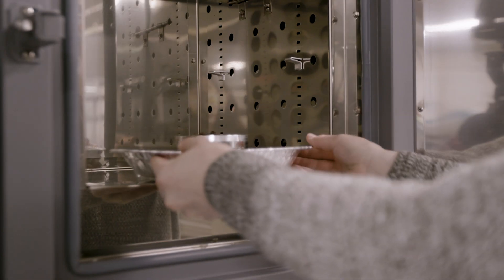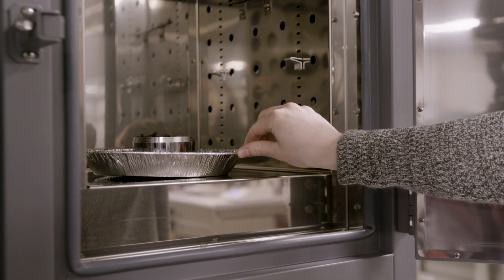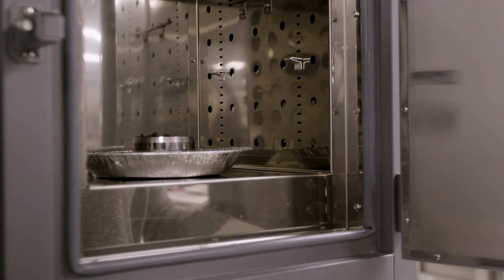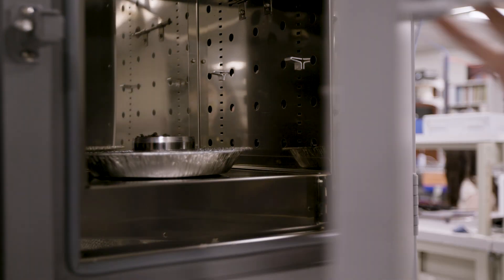Dry the soil sample in a drying oven at 105 degrees Celsius for at least 24 hours.